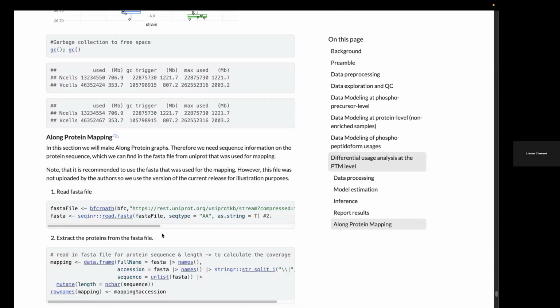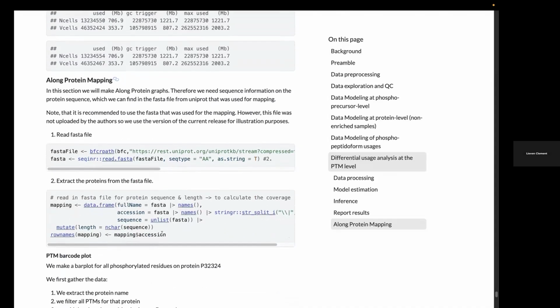Yes? The reason is that I'm not familiar with Biostrings. So if we talk together, help me out to make the vignette better. Yeah, okay. I'm happy to get that feedback. It's the first time that I work with strings. So that was my humble solution to the problem.